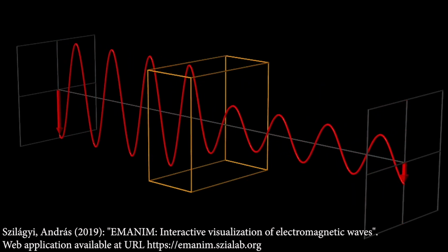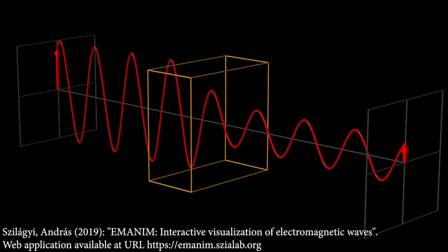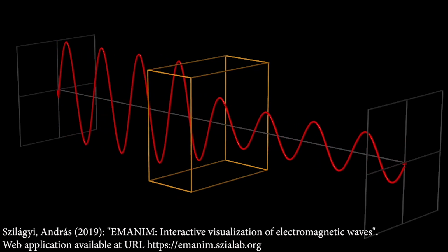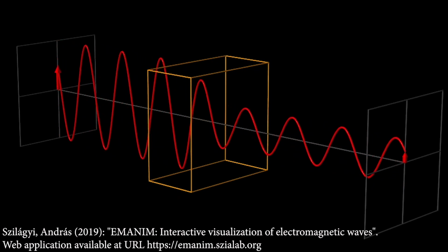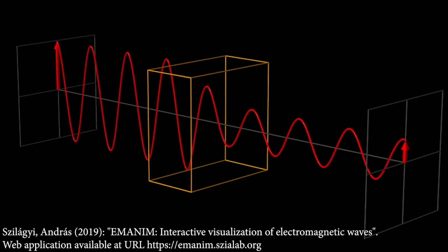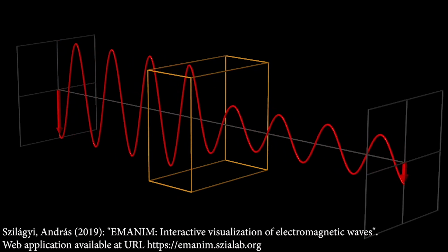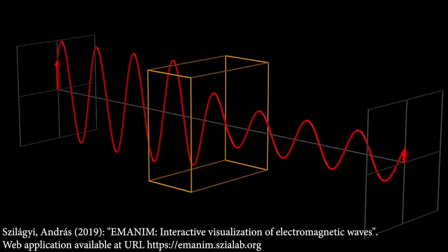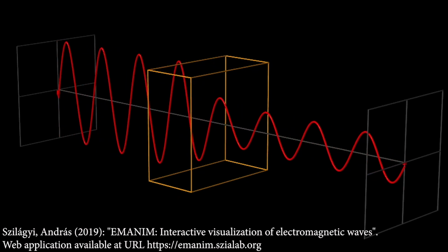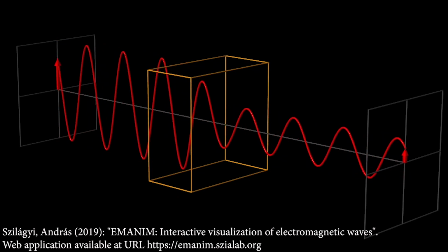So if we put this material in here and it's able to absorb in the path of the light, and it's able to absorb this particular energy of light because the electrons in that material, there's some energy transition level in that material that matches precisely the energy of that standing wave, then some of that light goes away.